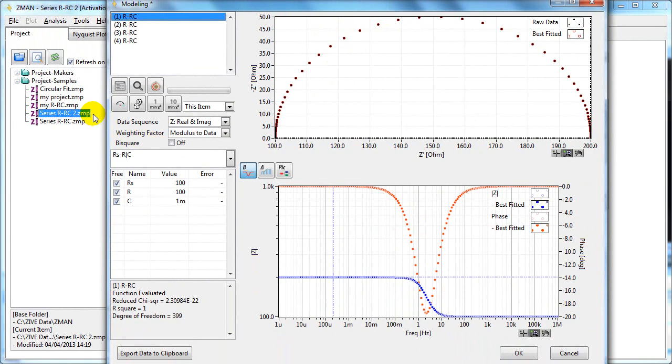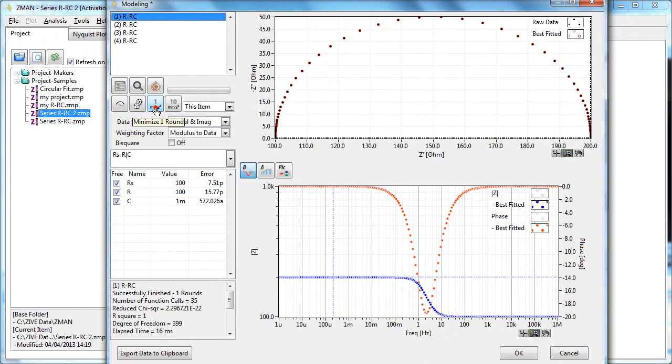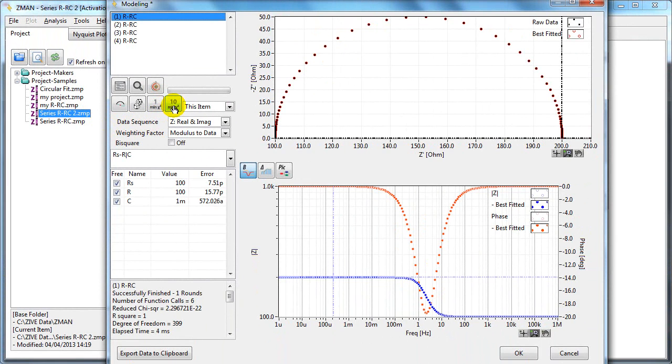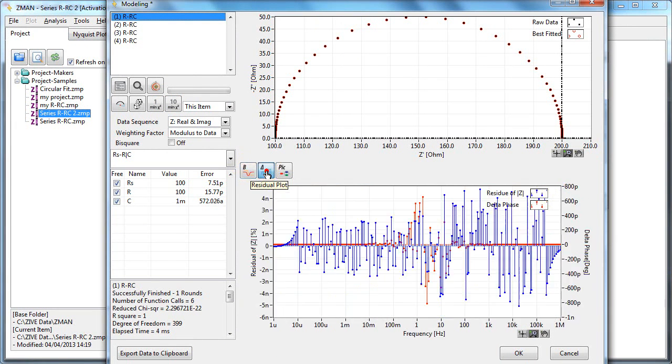To fit the data, you can click either the one round minimise or the ten round minimise. And now you can click here in the residual plots to see the difference between the model data and the raw data.